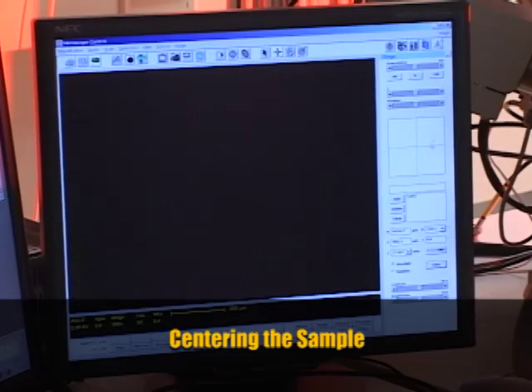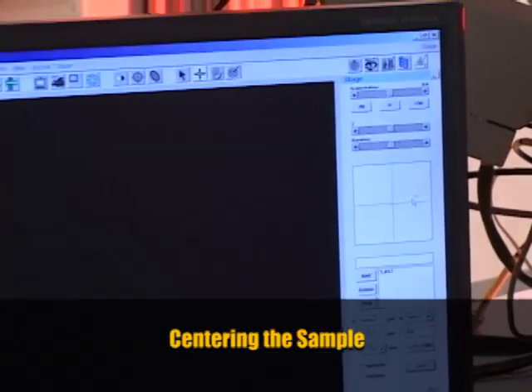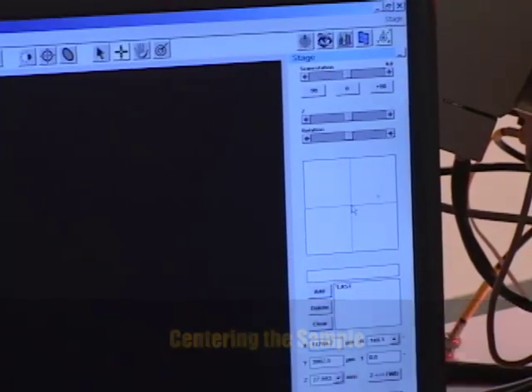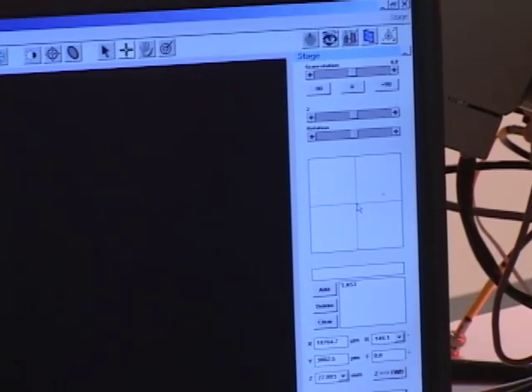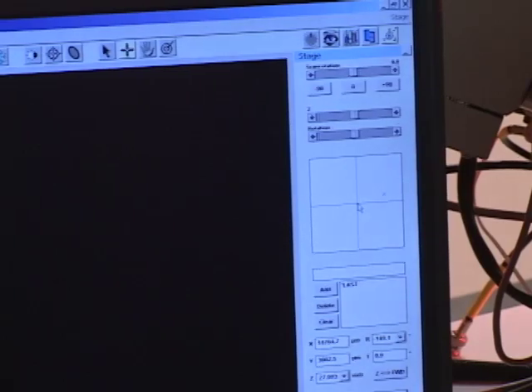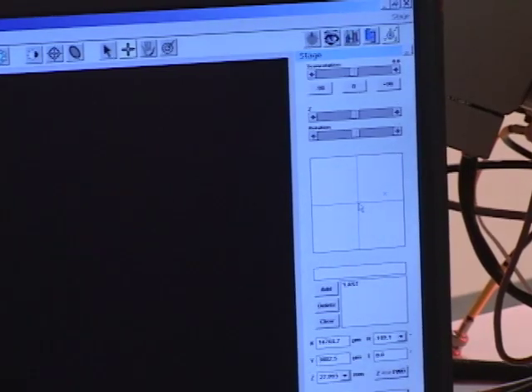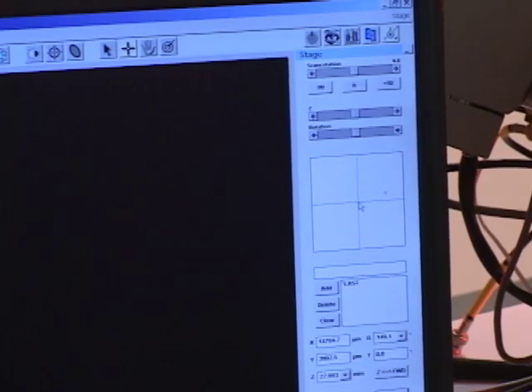Open the stage submenu. And that brings up a small map of where my sample is located. The X on this map indicates the center position where the beam is actually coming out. In order to recenter the sample, I'm just going to left double click at the center of the crosshairs. And you'll see the sample move to the center position on the CCD monitor.